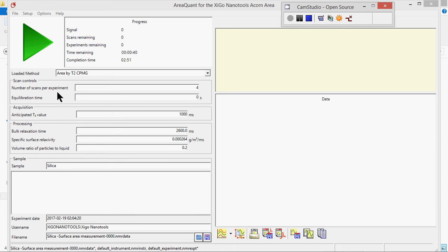The only time that you have to be concerned about setting the number of experiments is when you're working with a particle which settles very rapidly. For example, barium titanate suspended in ethanol toluene. Barium titanate has a density of about 6 grams per cubic centimeter. The viscosity of ethanol toluene is less than 1 centipoise. So if the particles are large, it would be difficult for them to remain suspended. But aside from that, the parameters are exactly the same.